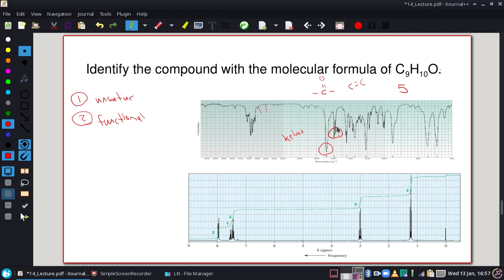But I don't know any of that for sure. I just have those as suspicions. Now, I really do like this suspicion because those 5 elements of unsaturation, that carbonyl only took care of one of them. All right, so we have a general idea of functional group when we have elements of unsaturation. And in general, we can safely say on this one, we know what one of those elements of unsaturation is.